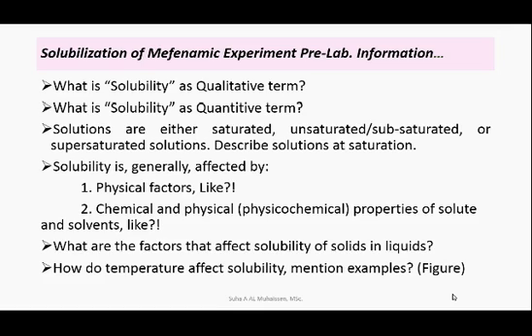Remember that solubility is a function of chemical structure. Salts of acids and bases have the best chance of attaining the desired degree of water solubility at the desired pH, while other compound classes, either neutral molecules or very weak acids and bases, which cannot be solubilized in water within the desired pH range, may require the use of non-aqueous solvents. Examples of non-aqueous solvents that can be used in parenteral products are listed in Table 5 in the assignment chapter.